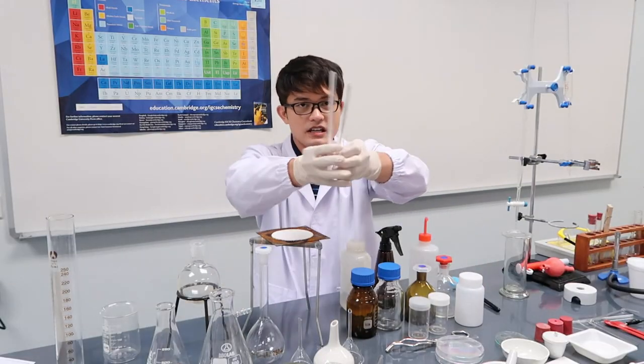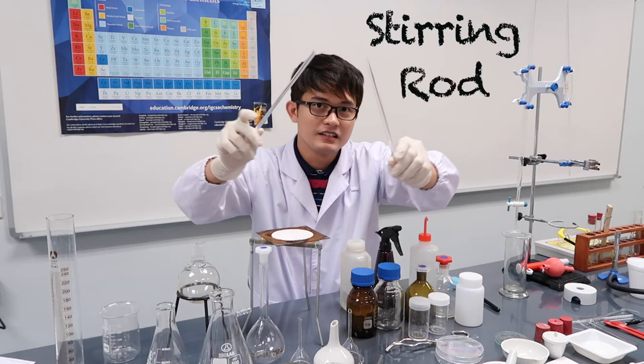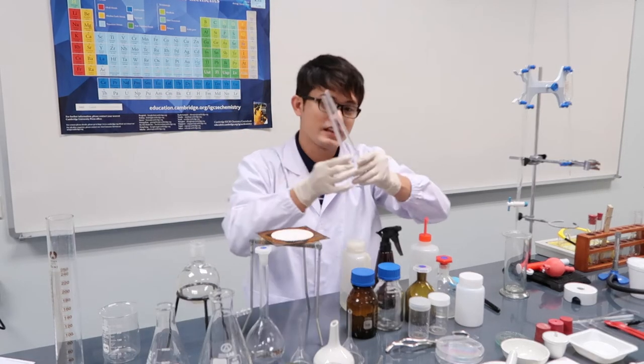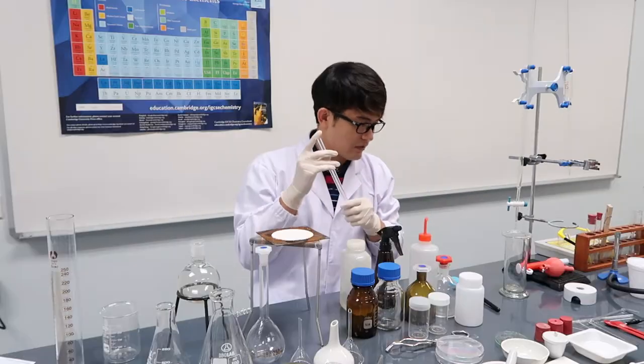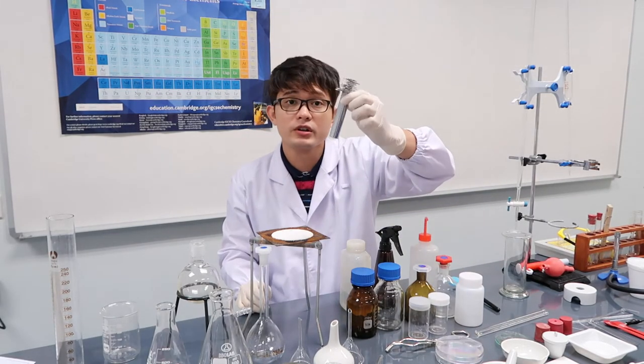This is a stirring rod. From the word itself, it's used for stirring and mixing — pang-halo. Now we have our cork borers.